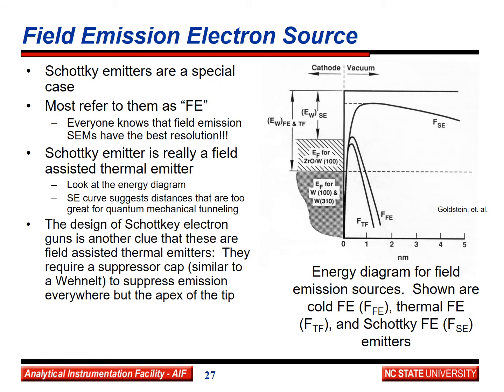Schottky emitters are a special case. Most people refer to them as field emission because everybody knows that field emission SEMs have the best resolution. However, in my not so humble opinion, and I admit that my opinions about SEM ceased to be humble many years ago, a Schottky emitter is a field-assisted thermal emitter.